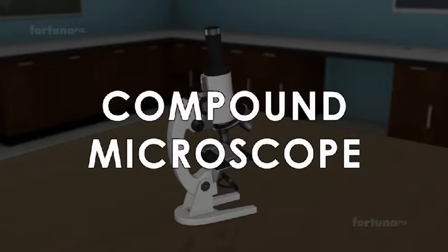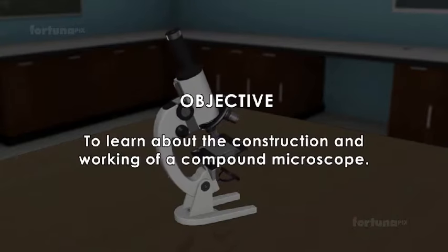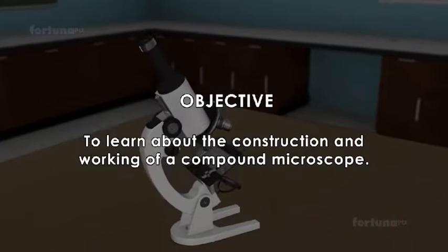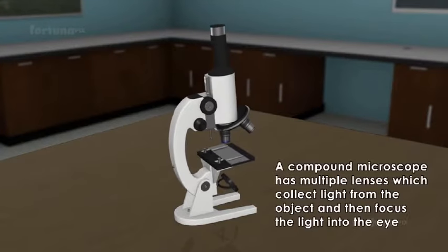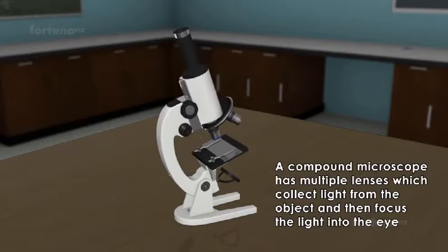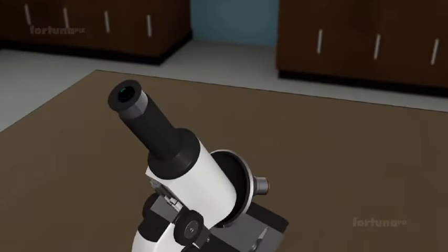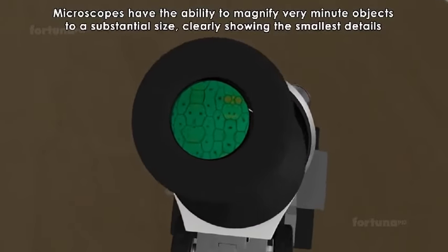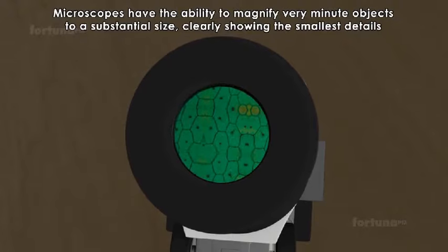Compound microscope. To learn about the construction and working of a compound microscope. A compound microscope has multiple lenses which collect light from the object and then focus the light into the eye. These microscopes have the ability to magnify very minute objects to a substantial size, clearly showing the smallest details.